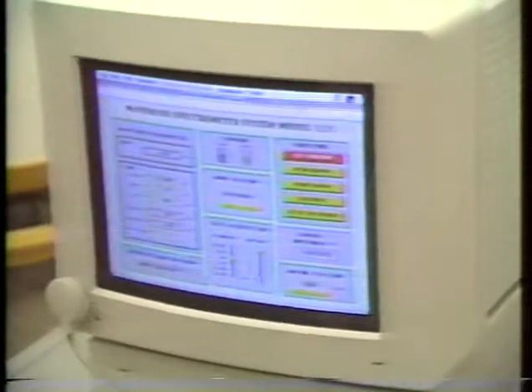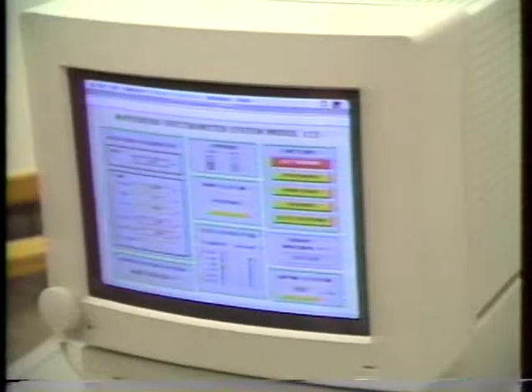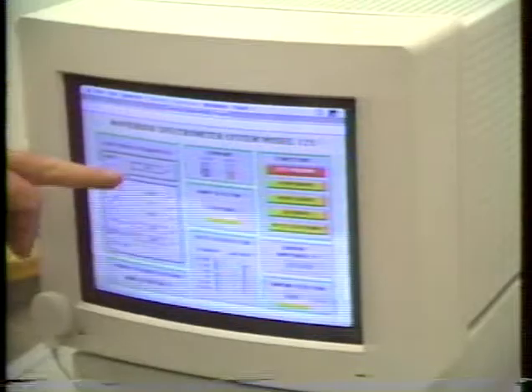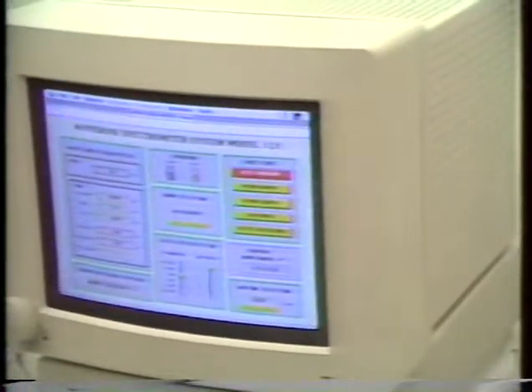So now we have the vacuum range of this particular spectral area, and you had found your highest point at 160 so that you don't run off scale, I presume, right? Stability, we're at 1%. Okay. Then do a reference scan. So you had set the stability, you set the reference scan, and then you initiate it.